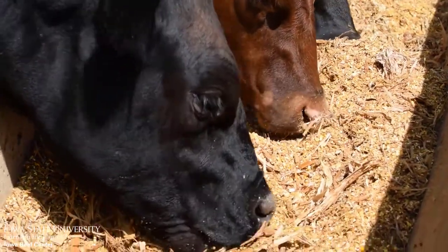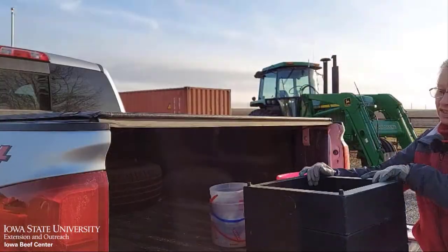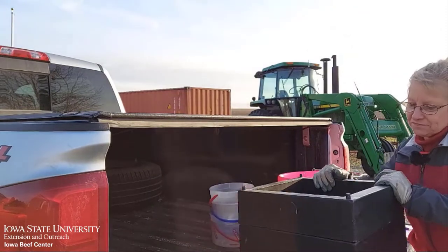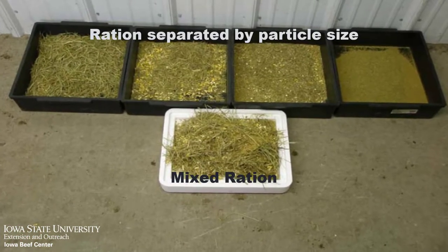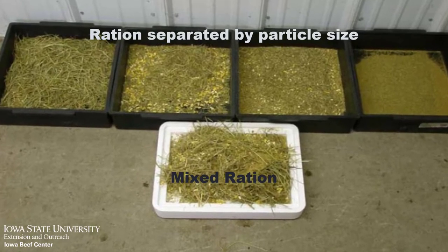Ideally, we'd like to see all four of these rations be the same, but that's not always the case. This week, we'll discuss how to use the Penn State Particle Separator, or the Shaker Box. Originally developed to determine the particle size and rations for managing effective fiber levels in lactating dairy cows, we have adapted this tool for several feedlot applications.